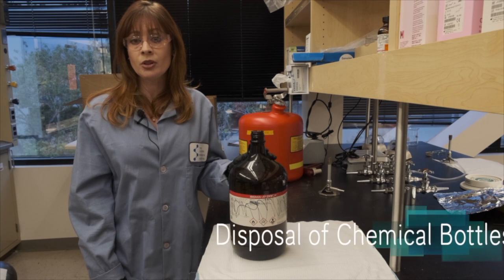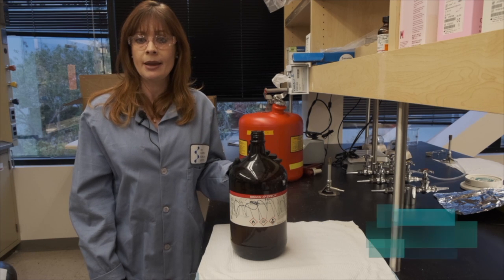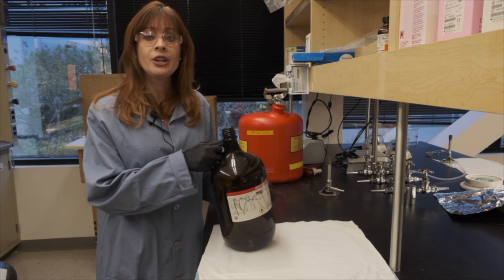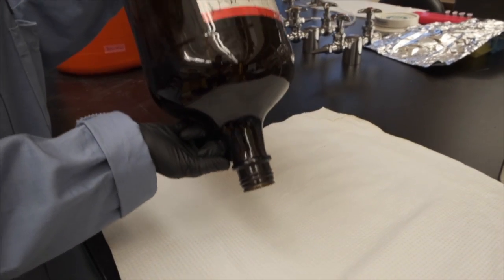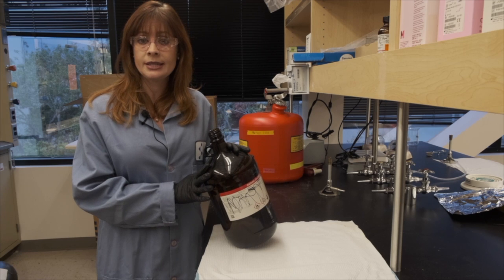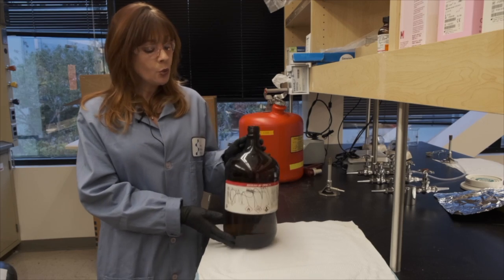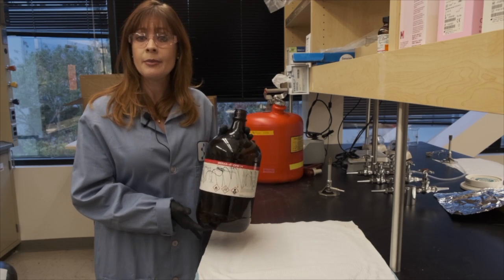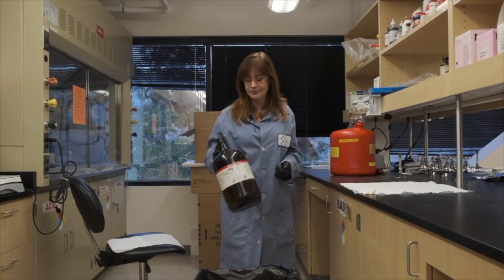Before you dispose of any chemical container in the regular trash, you want to make sure that it's completely empty. The term California empty means that if you invert the bottle, no pourable liquid comes out. Then it's ready for disposal. If there is residual liquid left inside, pour it into a hazardous waste container before disposing of the bottle. Once you verify that the bottle is completely empty, go ahead and deface it and then put it in the glass box for disposal.